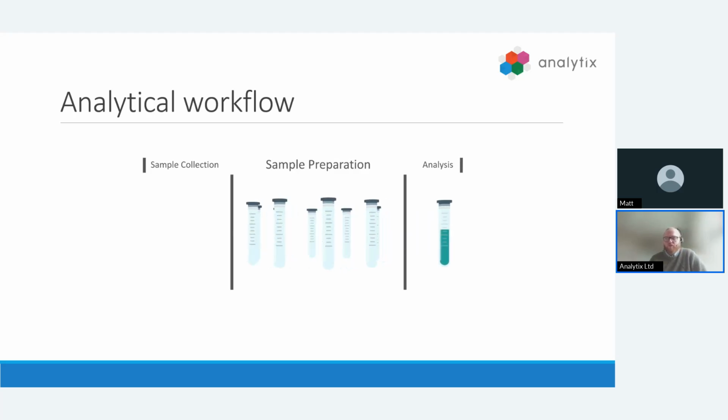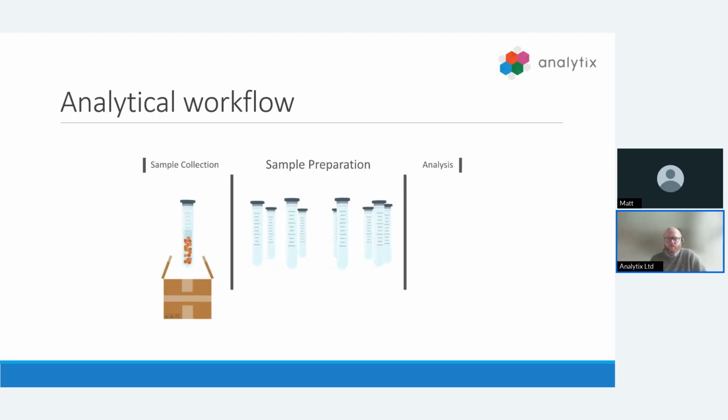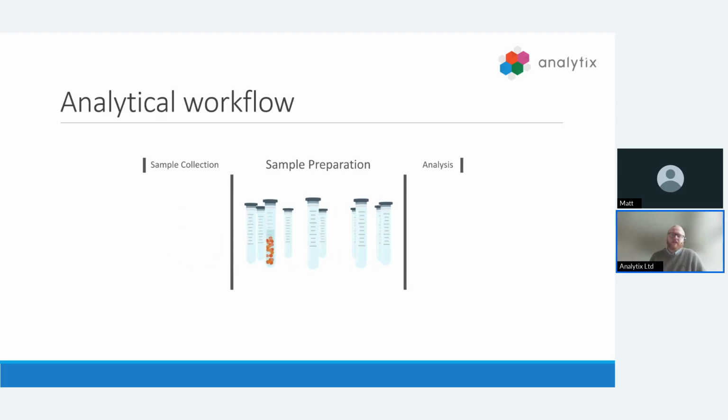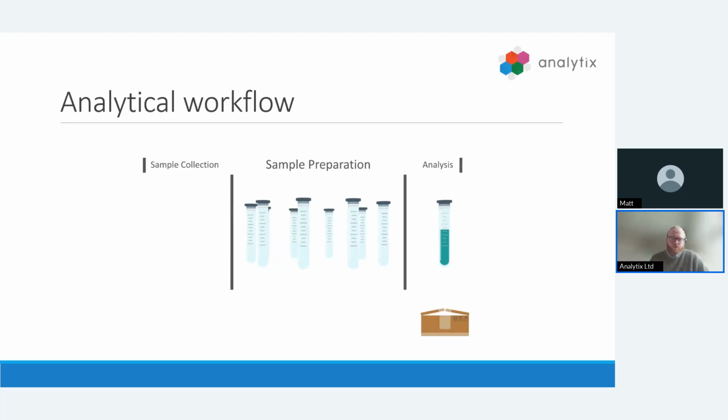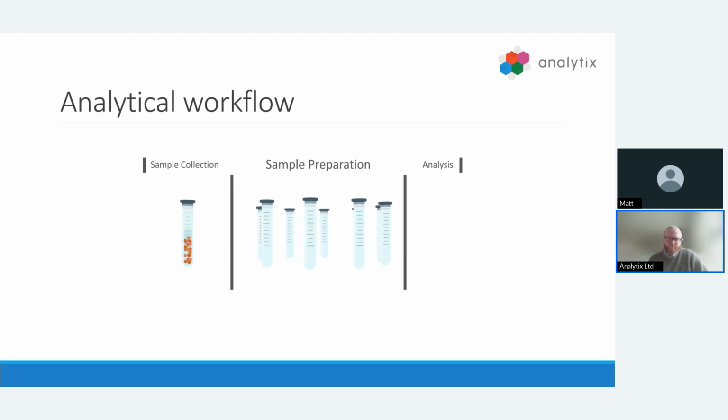Samples for this type of analytical technique are commonly introduced as liquids, and therefore these systems cannot handle solid samples. These types of samples need to be dissolved into a particle-free solution. This dissolving is typically carried out using an acid or acids, and these are chosen dependent on your sample type. And we refer to this process as digestion.